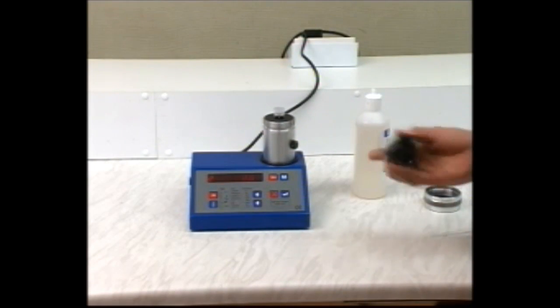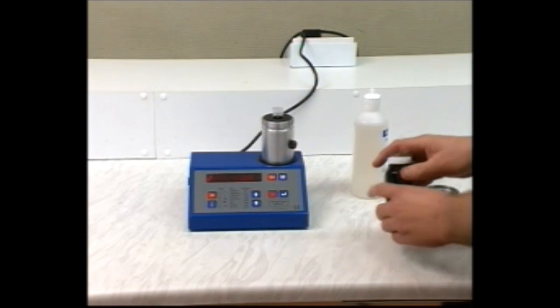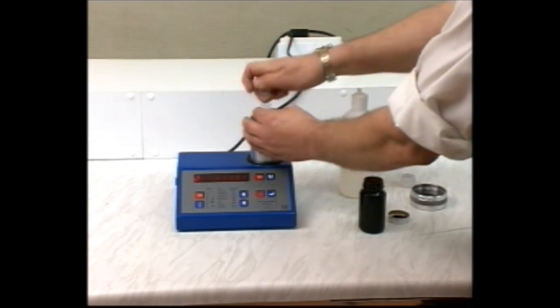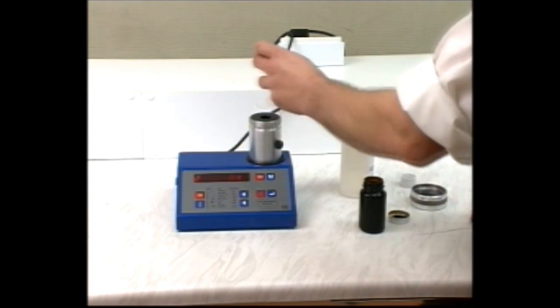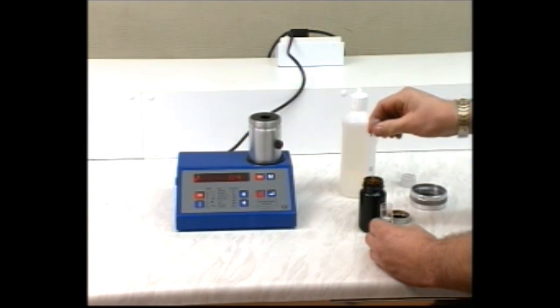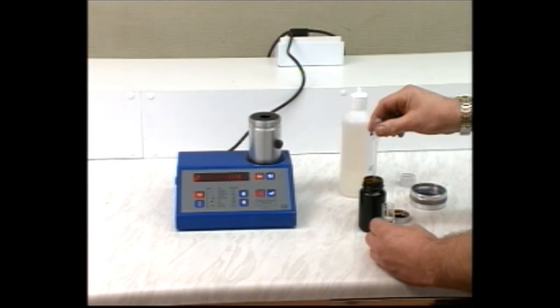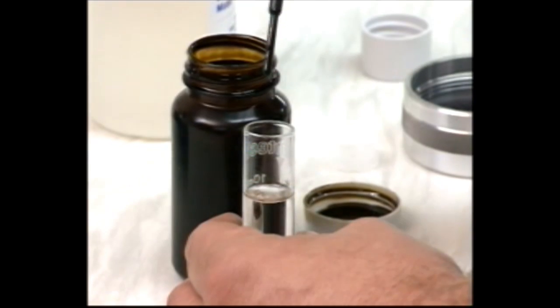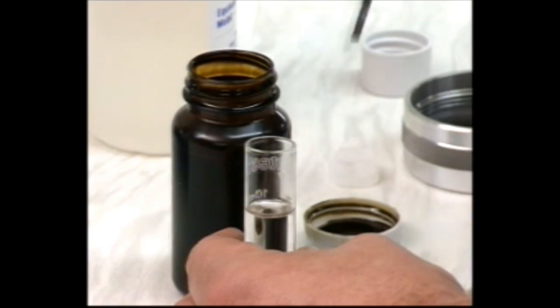Shake the oil sample well and remove a small amount with the disposable pipette. Return one drop to the oil sample, and add the next drop to the tube.